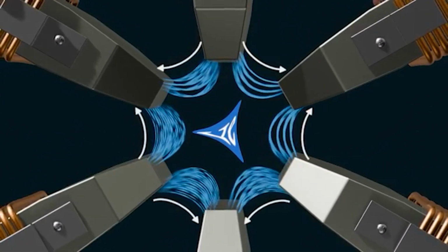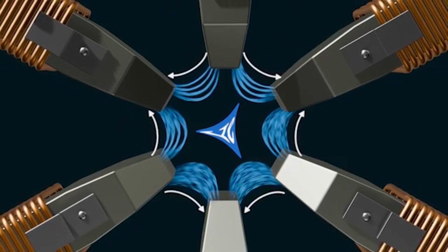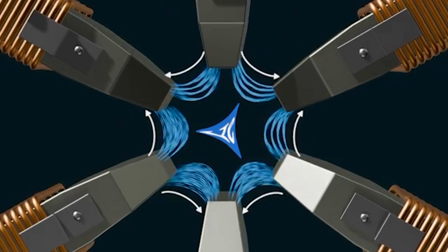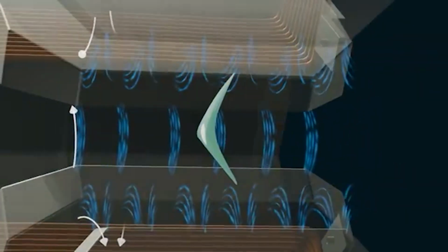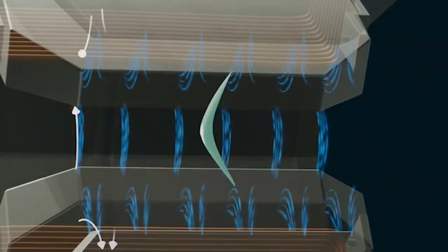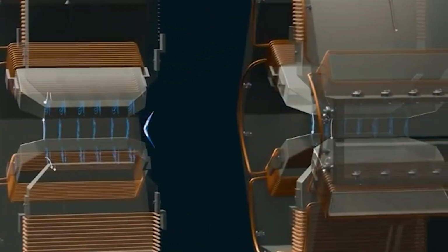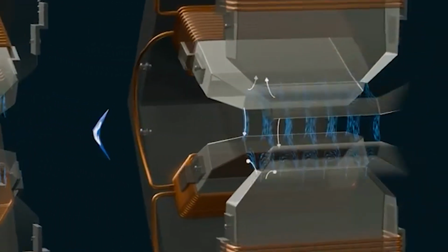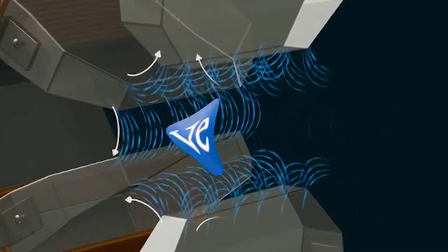And the circumference of the original beam would be pushed into the 3 corners, with the rest of the interior stretched out. But now, the middle of the image would have a slight concave bow, giving the effect of a small divergence. Then Rose, Haider, and Urban forced the beam through a second hexapole, one that worked the opposite way, so it would unbend the distorted image back into a circular shape.